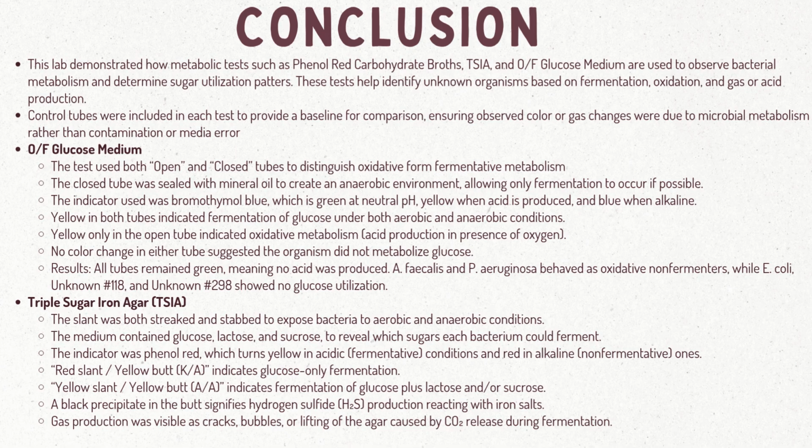Why is it important to include controls in each set of tests? And how can you tell strong versus weak fermenters? Those questions helped us realize how important these metabolic tests are in identifying unknown bacteria and confirming their energy pathways. Thank you.